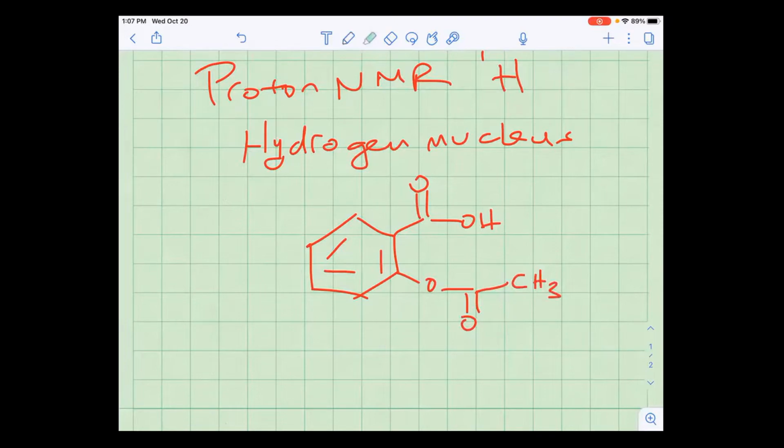Right, so you have protons here. You got protons here, 3 hydrogens here, and you got hydrogens on the ring.